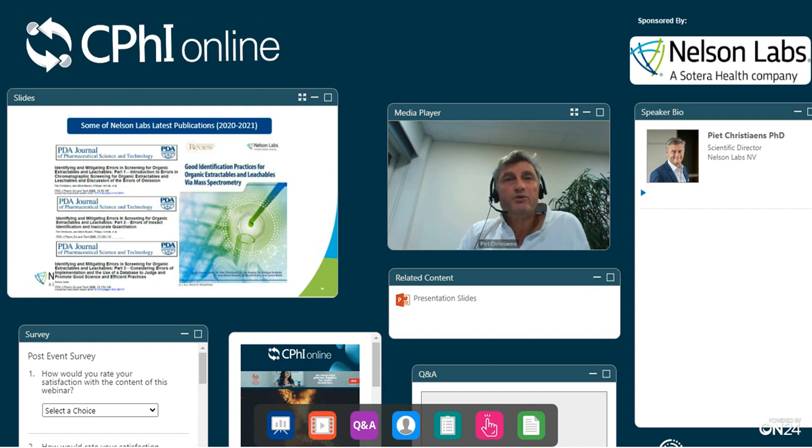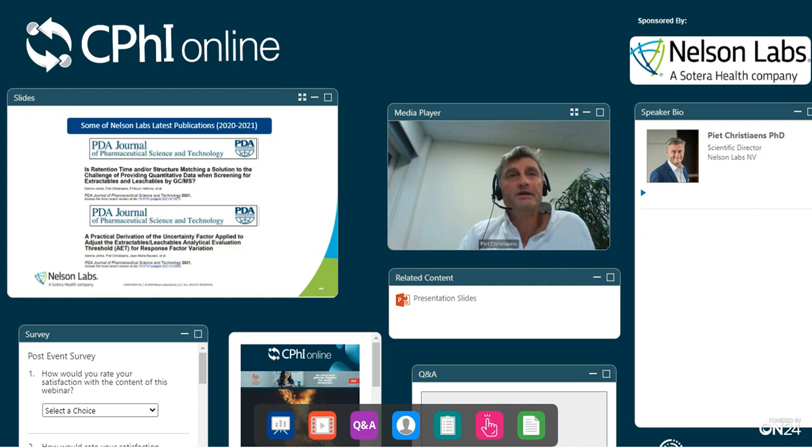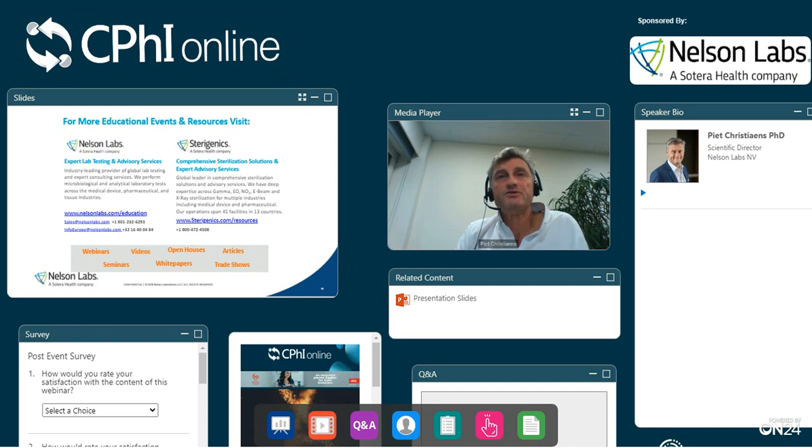With the next two slides, I would like to refer to some of the work we have been publishing in the last 2 years in the PDA journal. And also here I'm making a reference again to the ebook that we have published on good identification practices for organic extractables and leachables via mass spectrometry, for people who would be interested. And the latest publications that were accepted by the PDA journal you can find on this slide. Of course, Nelson Labs, together with Sterigenics, has much more educational information, such as webinars, videos, seminars, white papers, and so on. If you would be further interested, please feel free to consult our joint websites to find the information that could be interesting for you.